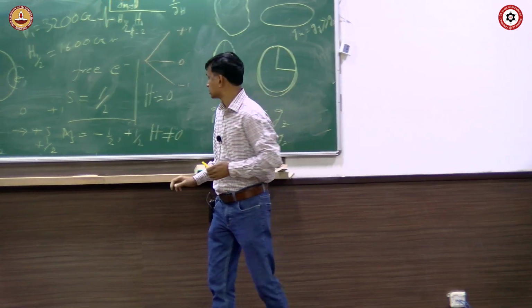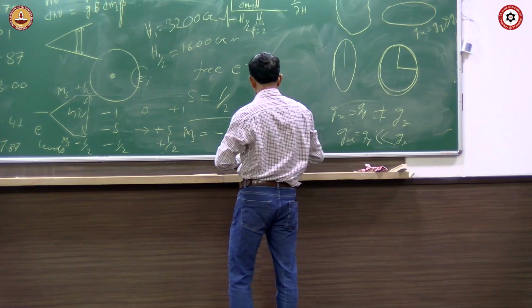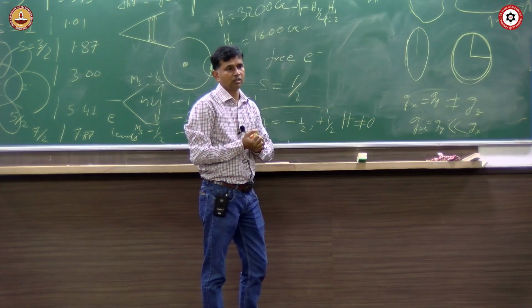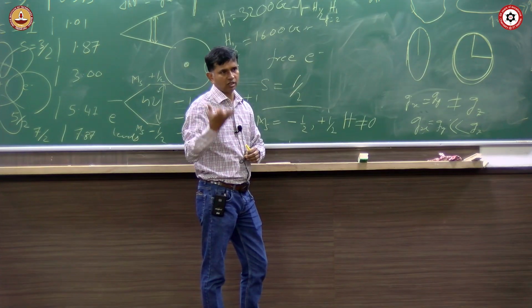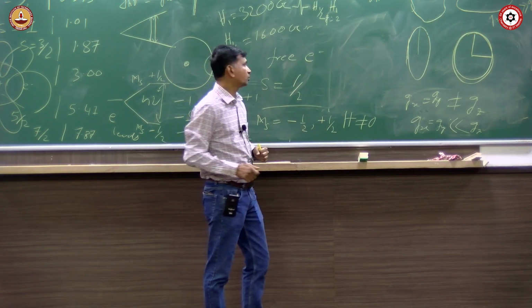So now let me go to the copper ion. A copper ion is always a little bit distorted, because of the Jahn-Teller distortion, so it cannot make all bonds the same. It is always a distorted geometry.